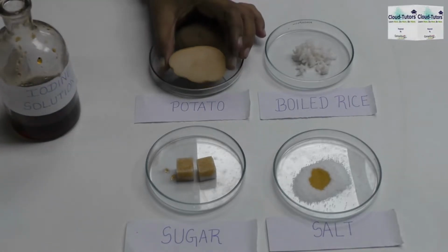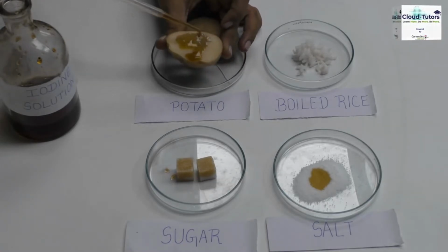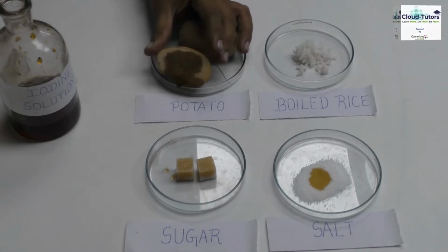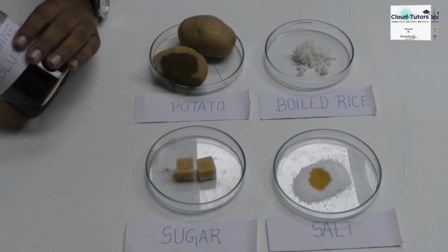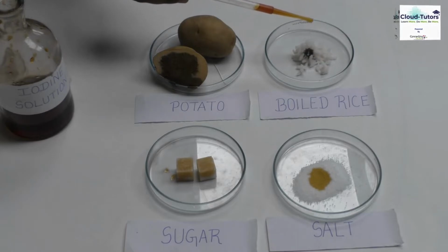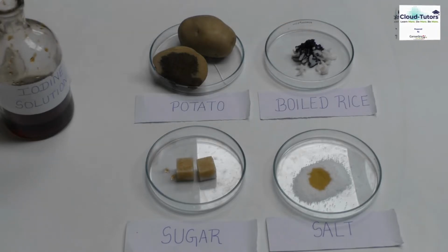For the potato, I've taken a raw potato and cut it in half. I'll just drop a few drops of iodine onto the potato. You can see there is a bit of dark stain being formed on the potato. Now at last we will take it to the boiled rice. Boiled rice, as soon as I drop, as you can see, is turning a very evident bluish color, correct?